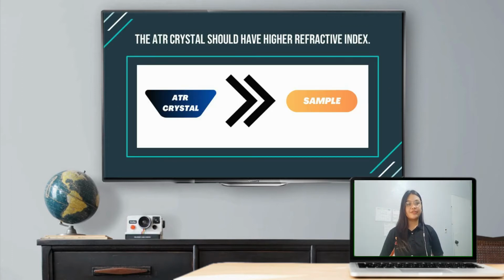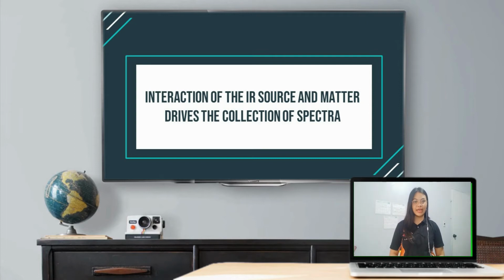Because the refractive index of the ATR crystal should be greater than that of the sample in order for the spectrometer to read measurements. So for example, we are investigating a sample that has a refractive index of 3. So we need to use an ATR crystal that has a higher refractive index. In this case, we can use germanium. Spectral data is collected during sample introduction because the infrared light from a source interacts with the sample matter.